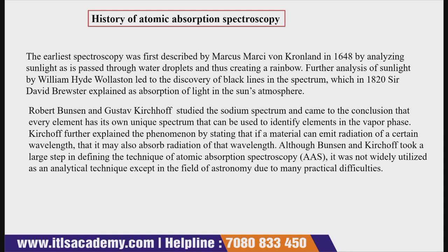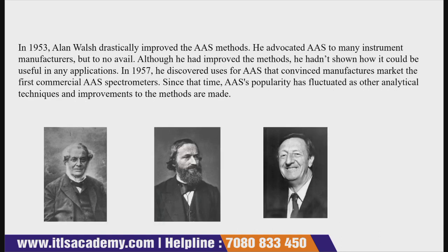So, Bunsen and Kirchhoff took a large step. What was the large step? They defined the technique of atomic absorption spectroscopy, but it was not widely utilized as an analytical technique, except in the field of astronomy. Why? Because many practical difficulties came into the path. So this is the history.